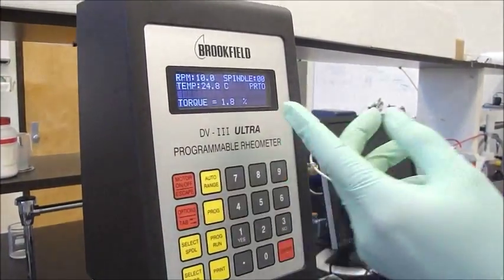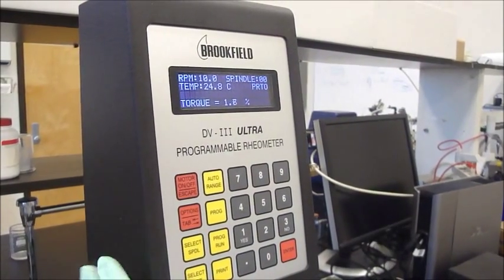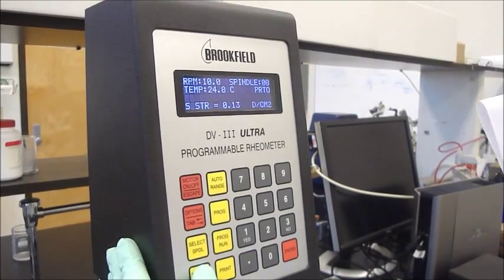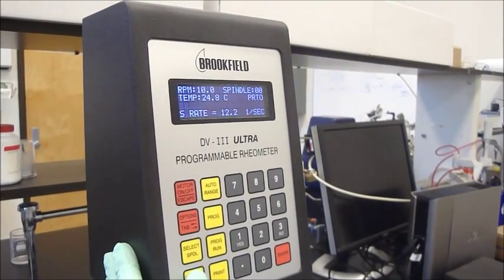After the reading is stable, you record all the data including torque, viscosity, the shear stress and the shear rate.